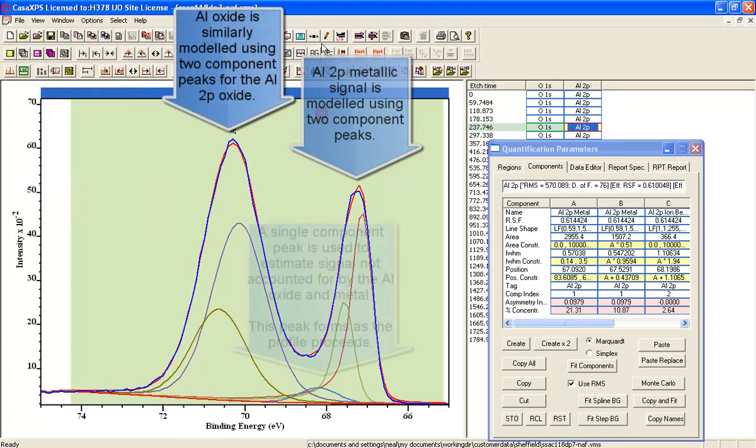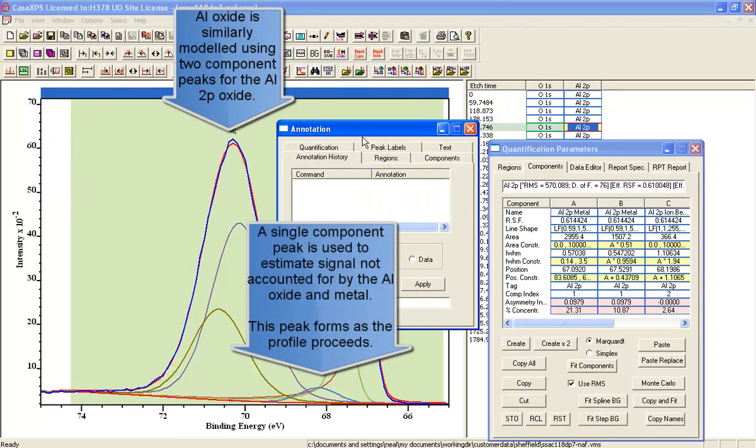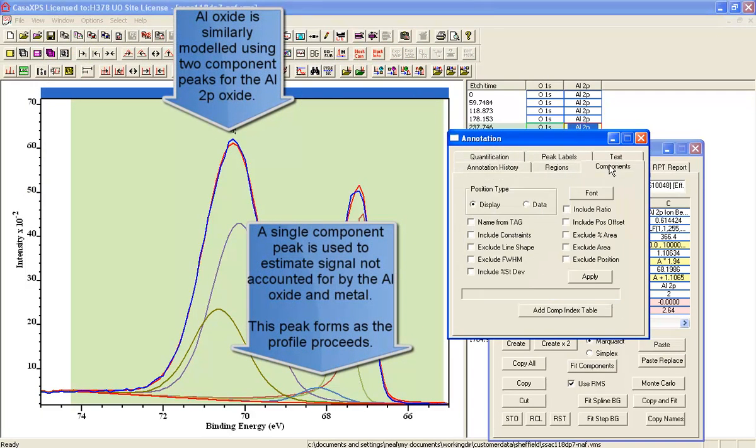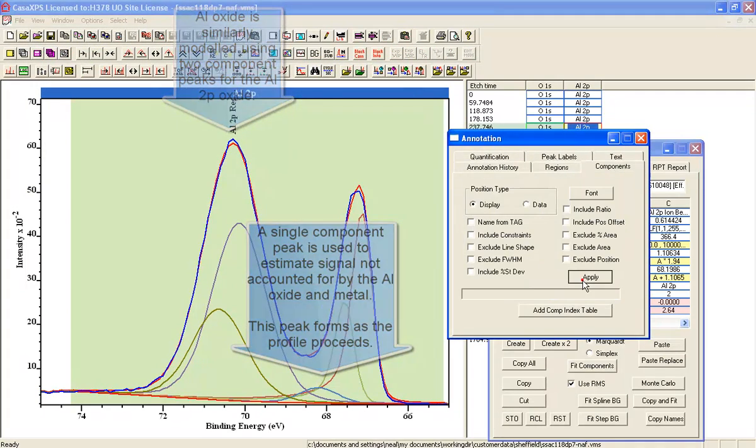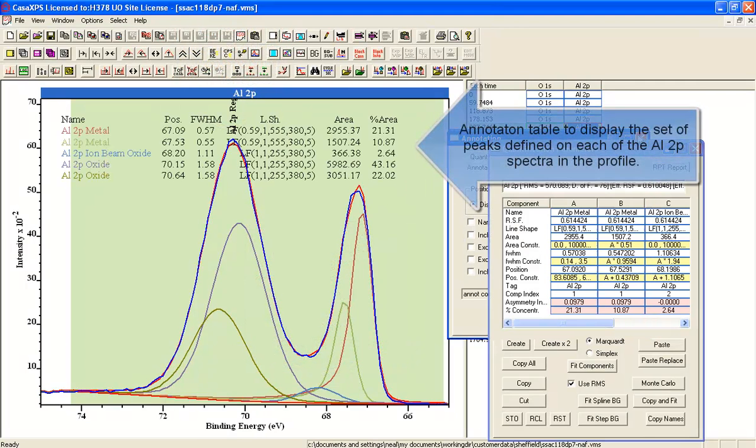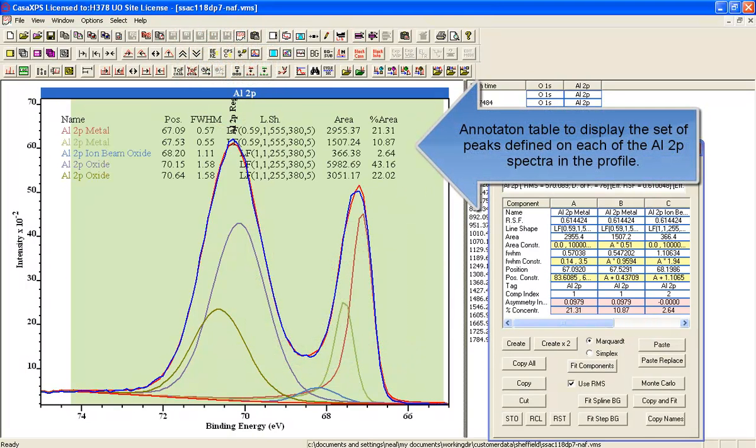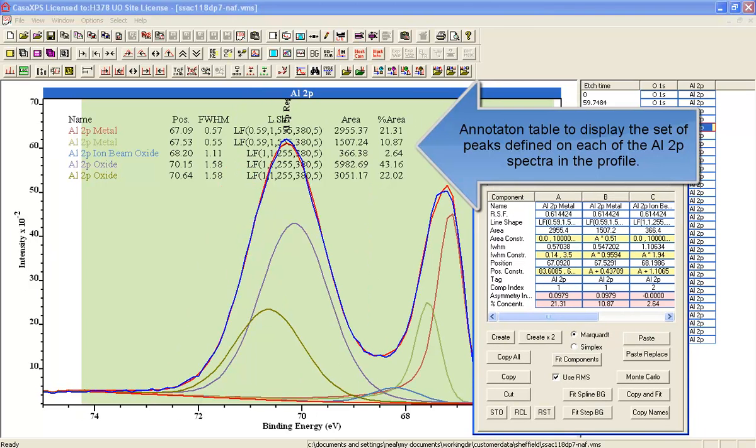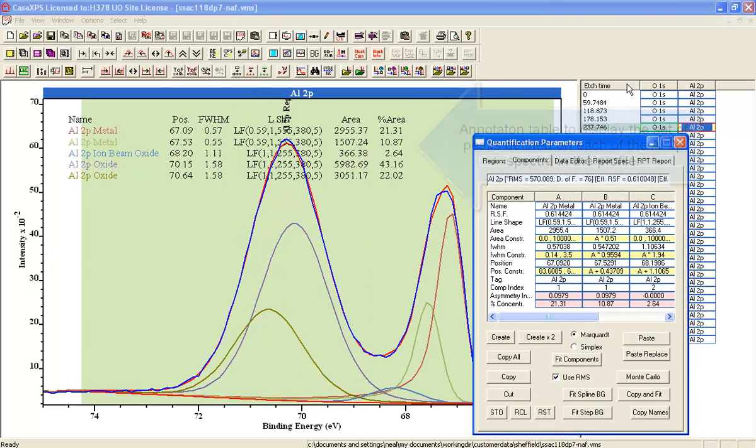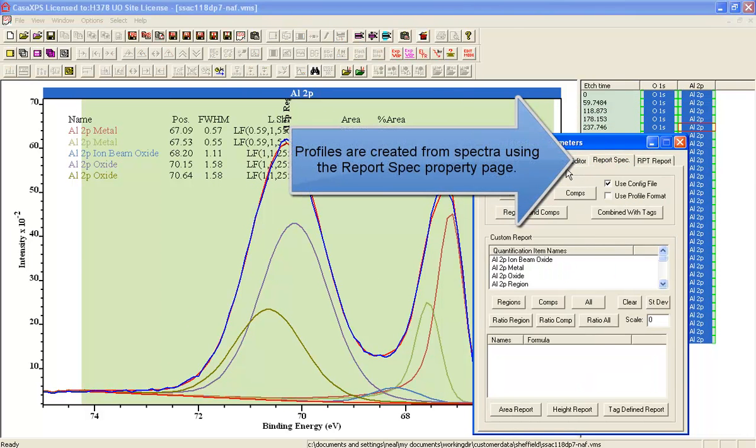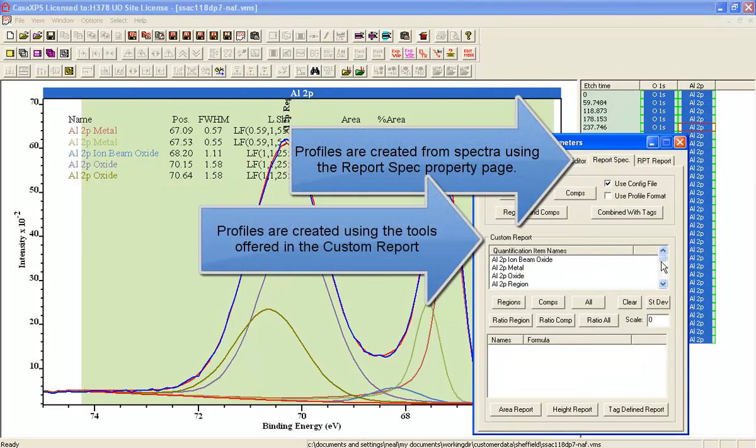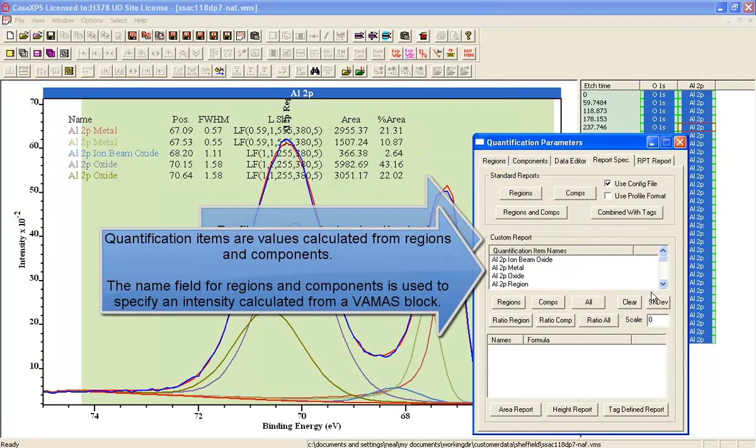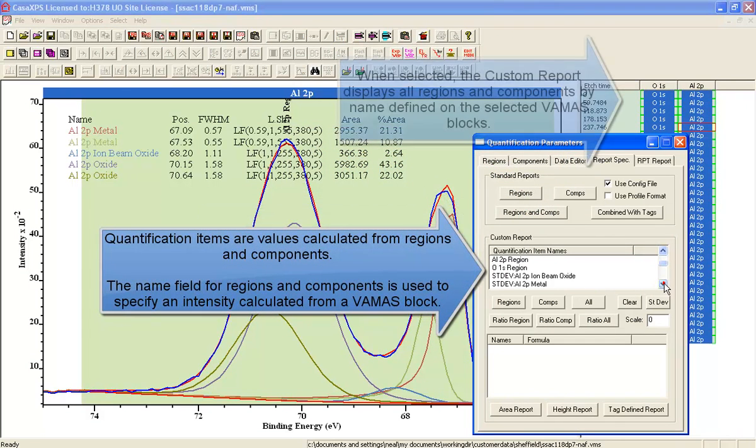The Al 2P has two pairs of doublets which are from the oxide and the metal. We've assigned these the same name: Al 2P Metal and Al 2P Oxide. The idea is that the custom report will sum any regions or components with the same name.